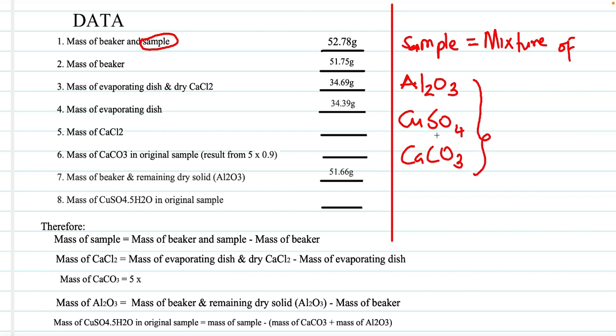Our aim is to separate this mixture. They are heterogeneous because, how will I put it, they don't really have the same phase. Their sizes are not the same, even if all three of them are solid.